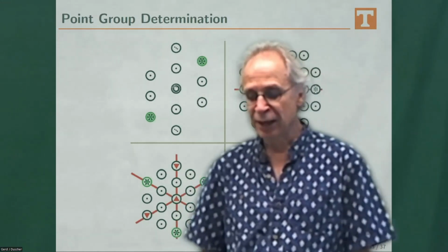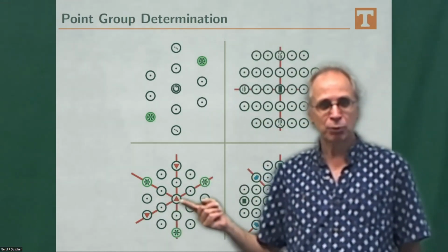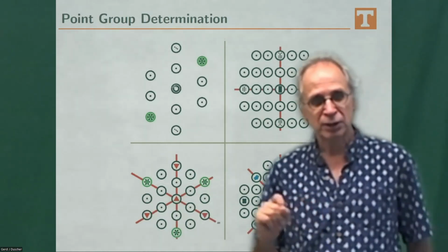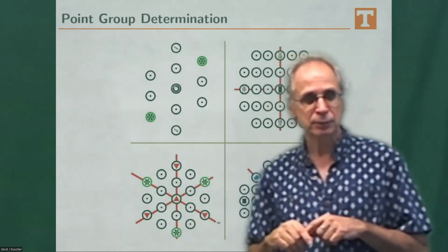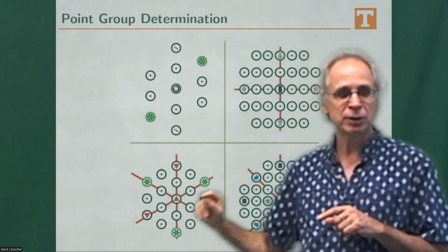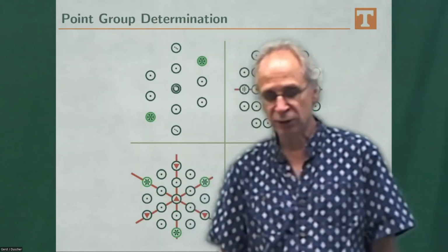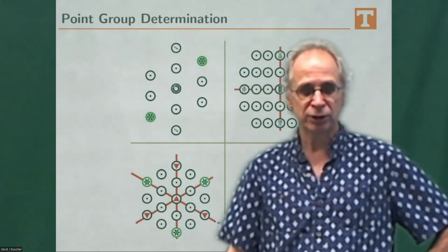I just see that. Anyway, and the same thing is if you have a single spot, so it would be the center spot, that has a symmetry. So you look at the symmetry of the whole pattern with their excitation error and of the zero spot. On that, you can get actually the full point group information with some tabulation and so on.